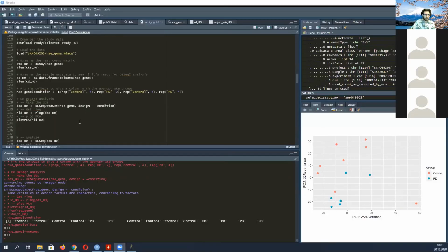So actually, Simon, what you're describing sounds like a good thing to discuss, just because it sounds like you're running into an issue that can very well happen to everyone. Would you actually mind sharing that? Thanks. Can I share screen? Yeah, go for it. Does that work? Everyone see code?